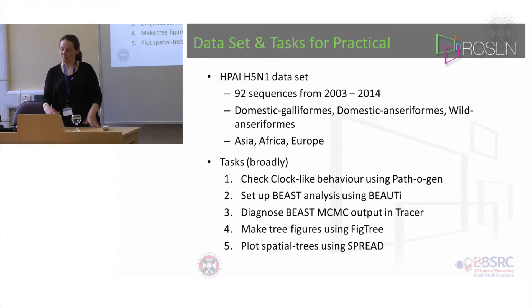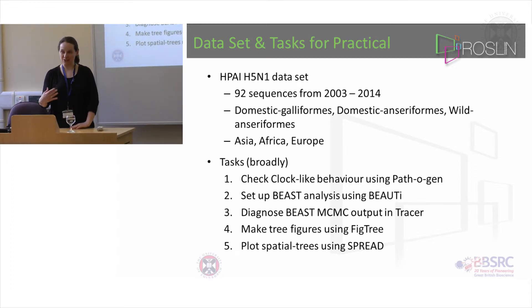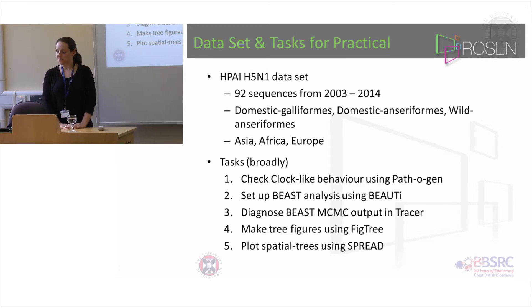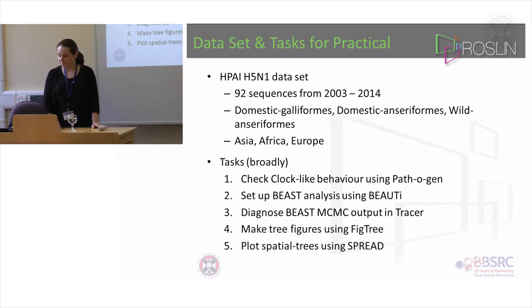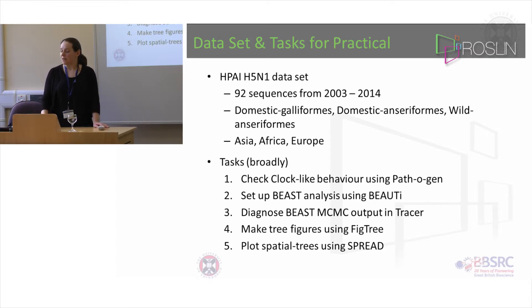I've made some pre-run outputs for you to have a look at. In the third task I want you to look at the outputs that I've already run using a program called Tracer. This is where you can see all those posterior distributions and things, and those use the log files.